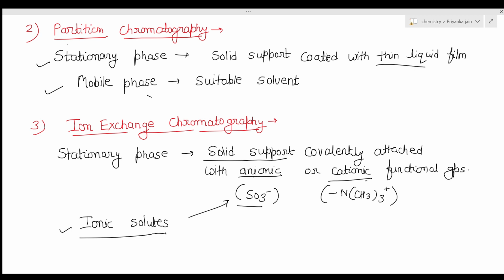Okay, there is not absorption. Absorption technique is different. There is only the electrostatic attraction between this solute and this resin. So they get attached to it by the electrostatic forces of attraction, and they are forming bonds here, right? Now we are passing the mobile phase. So what will happen? Some of the solute components are more strongly attracted to the stationary phase, and some are less strongly attached. The substances that are less strongly attached will come faster. In this way we can separate them.